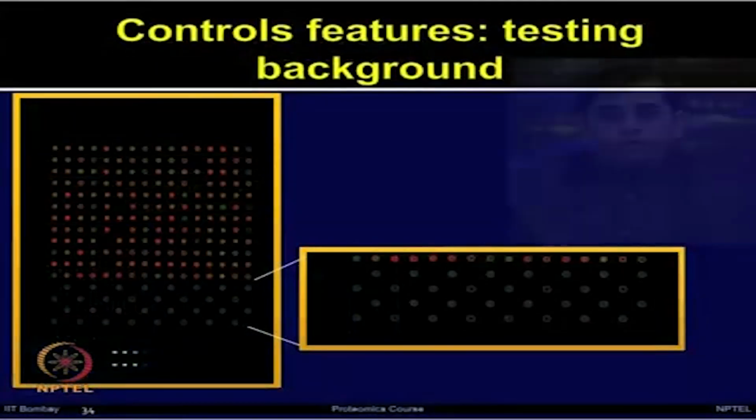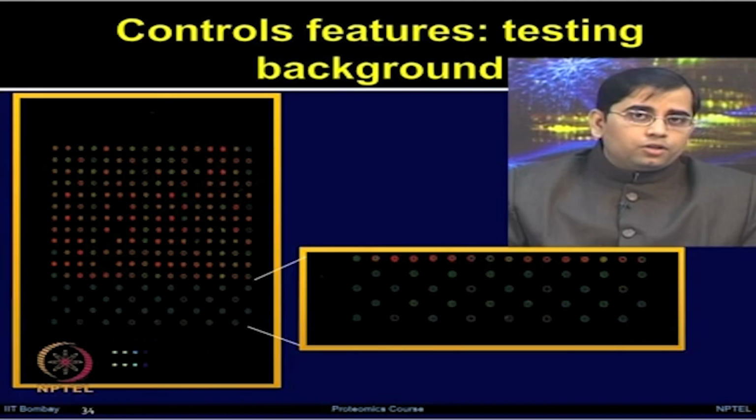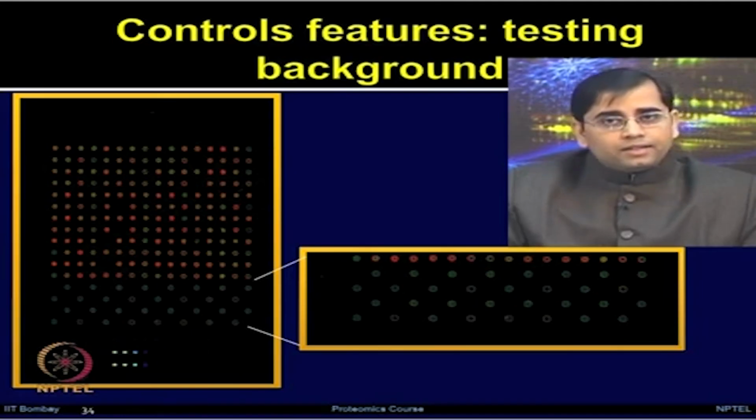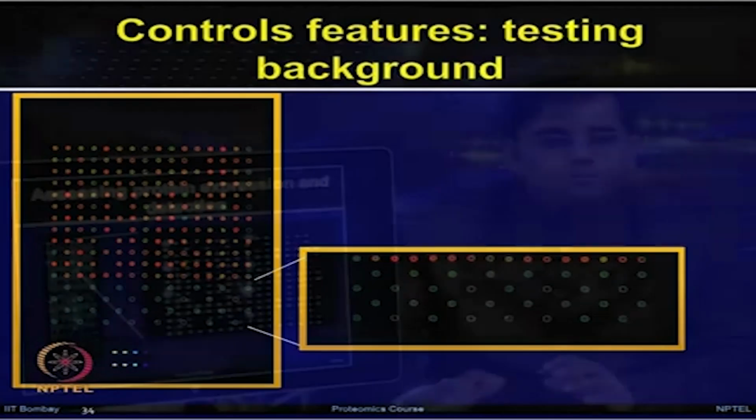Since we are talking about NAPPA arrays, we are talking about clones containing the GST tag. So, it will be a good idea to have different spots with the GST alone. You can have purified GST in a dilution series, so that you can use that for the calculation of protein expression later on.